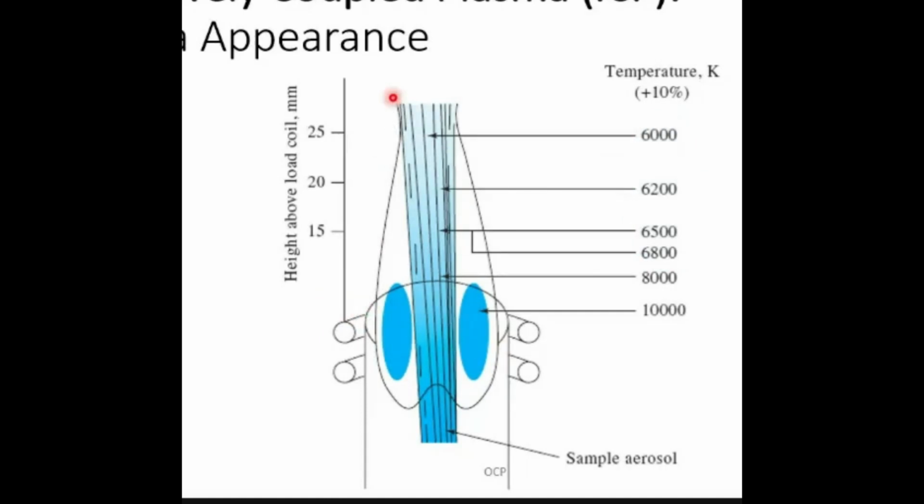Now moving forward, see, argon is quite a unique inert gas. The argon gas itself has very few emission lines. So what is the advantage of argon having very few emission lines? It will not interfere with the spectra given by the elements in this region. Or even if it is interfering, we can easily identify which lines are given by argon, and we can ignore it as background noise.